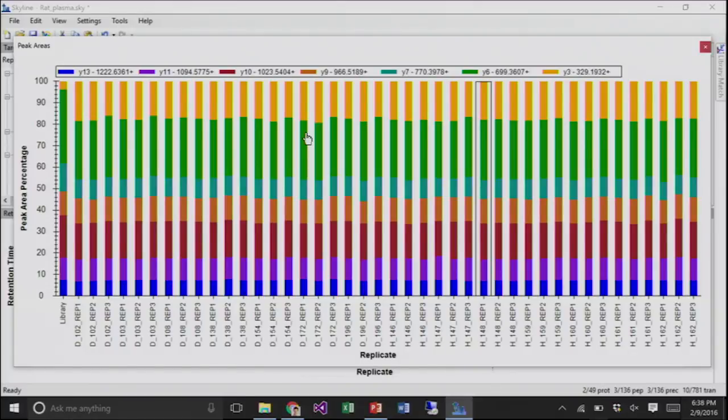No, but does anybody think we might not have the right peptide here? No, it's pretty darn close enough. I mean, we have a lot more Y3 signal, but there's a lot of signal out on Y11 and Y13, so it's not like it's dominated by Y3.